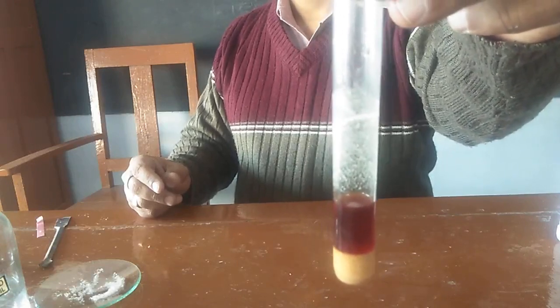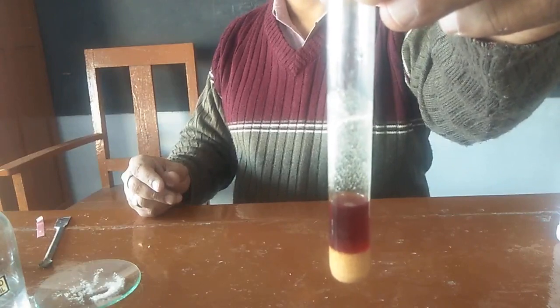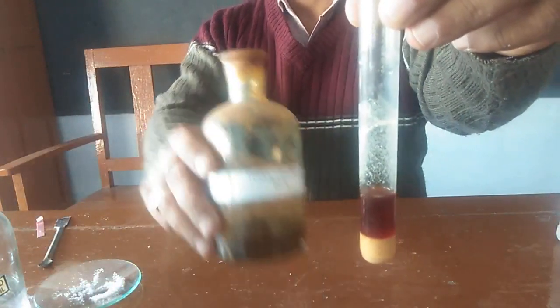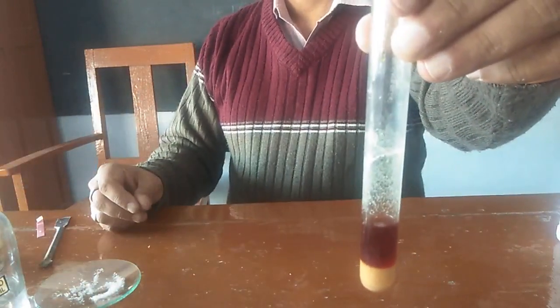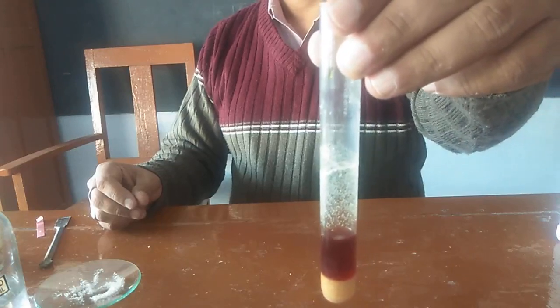Acetate ions react with ferric ions. We have used FeCl3, that means ferric ions were present. The ferric ions react with acetate ions and this coloration is due to the formation of ferric acetate.